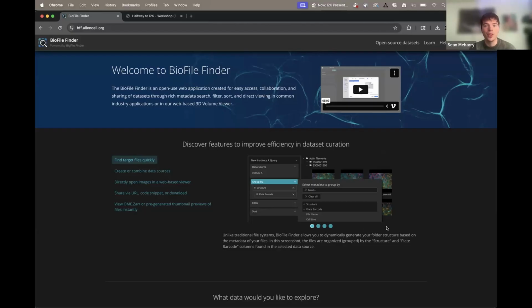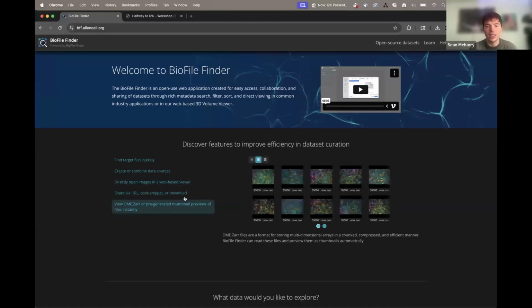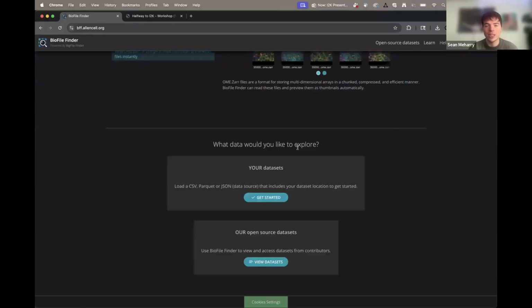And you would be able to go here now, and it's going to present you with this sort of thumbnail or video that's going to go over everything we talked about today for BFF. And then there are some descriptions here of various features, the highest level, like impact ones we think, as well as some prompts for how you would like to start interacting with BFF. So there's one for getting your data in here.